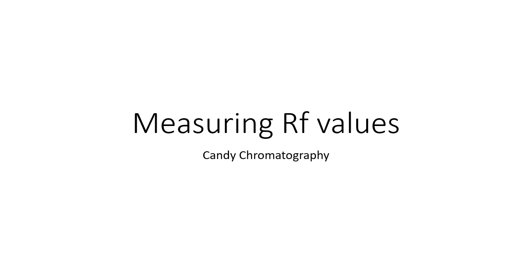Hey everybody! In this presentation, I'm going to show you how to measure the RF values for your candy chromatography experiment and show you where to fill out the data in your data table that you have to answer. So if you'll just view the next few slides and listen to what I have to say, we'll make this pretty easy.